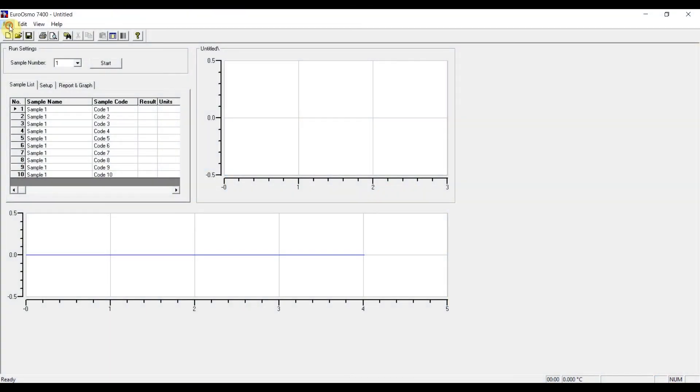The Euro Osmo 7400 is the software for the operation of the Knauer K7400 and K7400S freezing point osmometers. It is a simple software for the data acquisition and visualization of osmometry measurements.